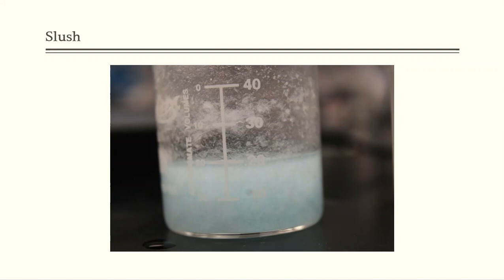I'm seeing more and more crystal. But folks, look at the shape and the way these crystals look on the side of the beaker. They are completely different than what they started off with before, right? We said that it kind of looked like laundry detergent before. But now these are white crystals, very rod-like and very jagged, and I can actually visually see that structure on the side of the beaker. I'm also seeing quite a bit of solid forming down in here, which is also a good thing.